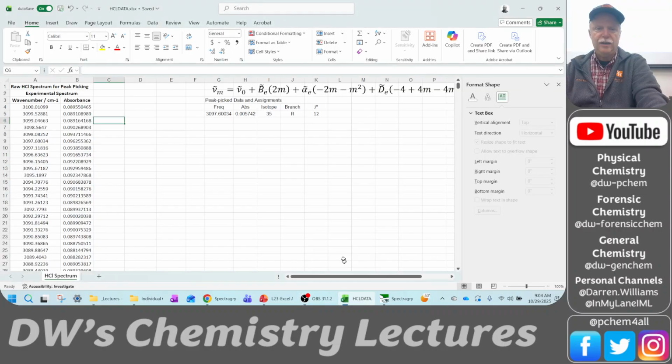Okay, good. All right, so today really is going to be a tutorial on y'all's project. You can see okay? So this is the data file that's on Blackboard. Okay. Now I did add this equation because that's going to help us when we get to this.